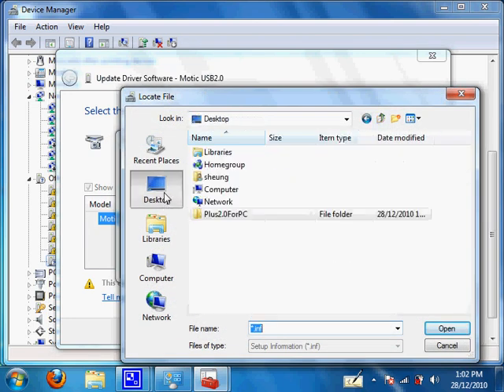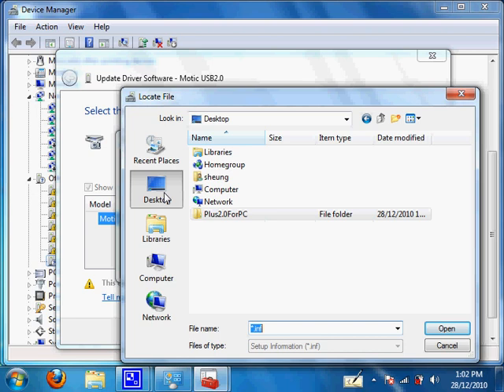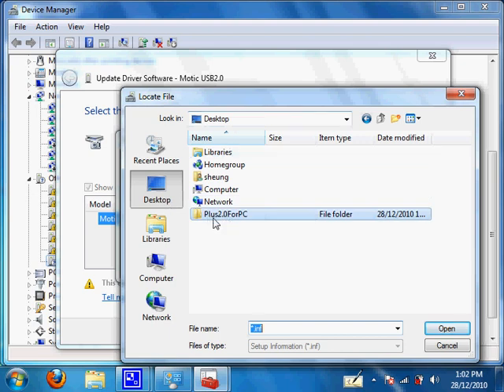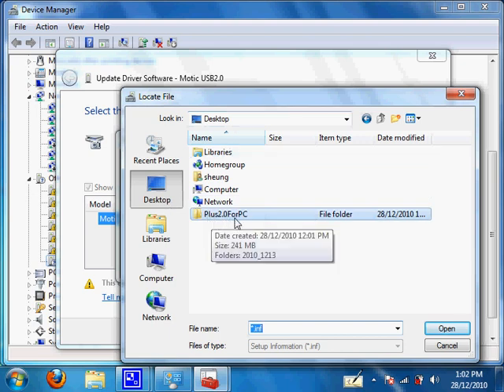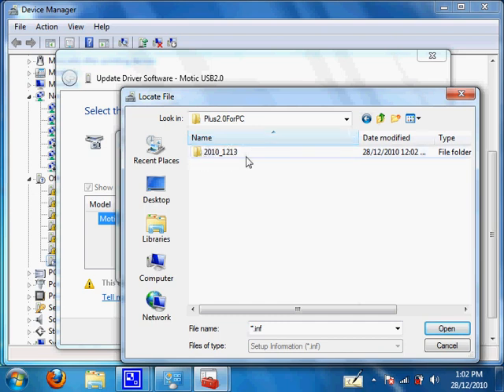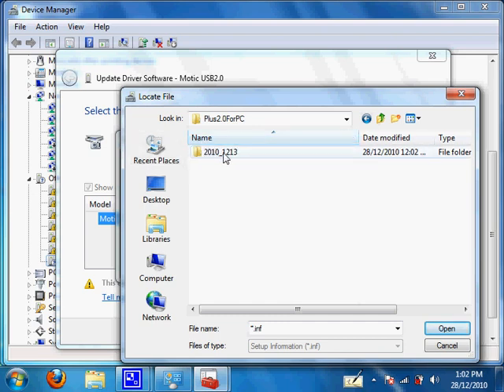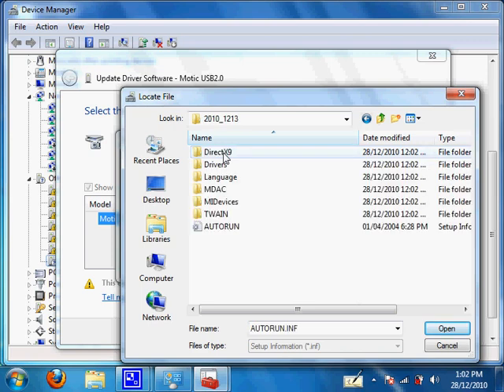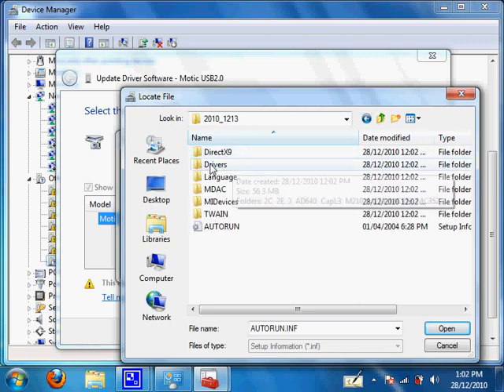And browse to your desktop or wherever you saved your software to, the extracted version. In my case, it was the desktop, click on plus 2.0 for PC. This version number may be different for your software. What's important is that you go inside and find the driver folder.